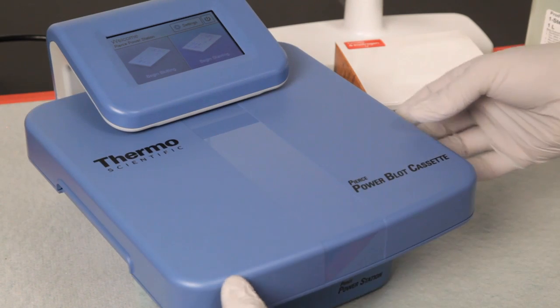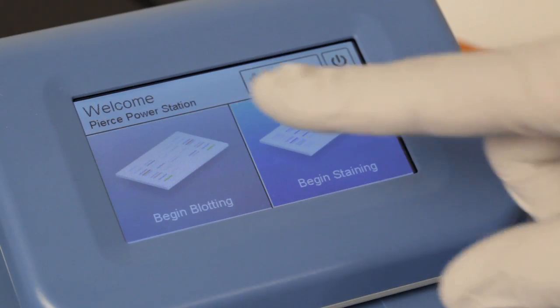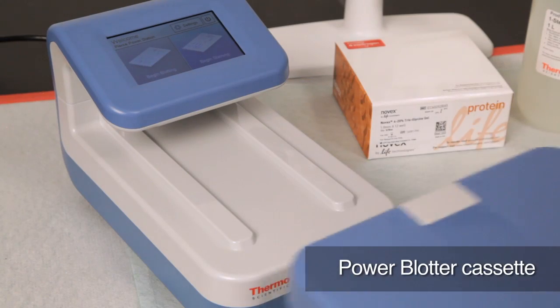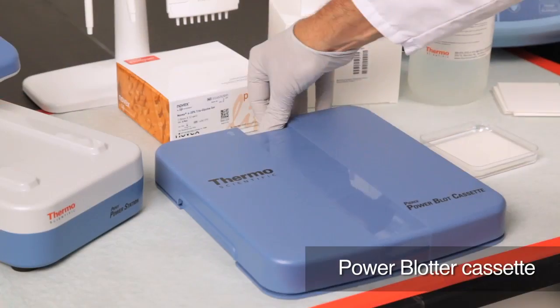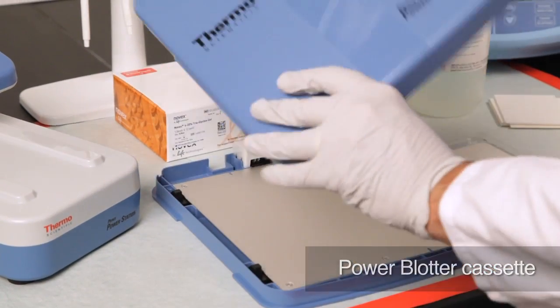The blotter consists of a stand-alone control unit with a color LCD touchscreen and a removable cassette that houses the platinum-coated titanium anode and the stainless steel cathode.